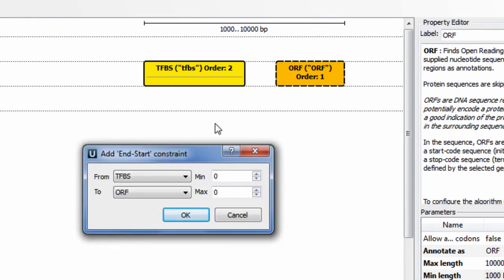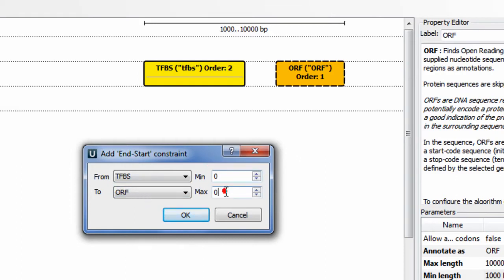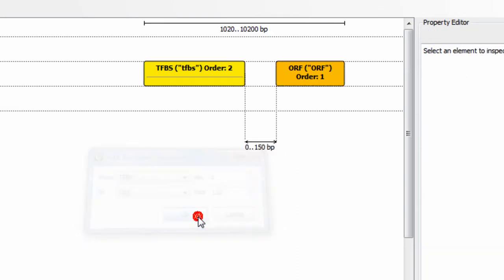A dialog pops up. Here I specify the algorithm elements that the constraint is imposed on, and set the minimum and maximum distances values. I press OK, and the constraint is added to the schema and displayed.